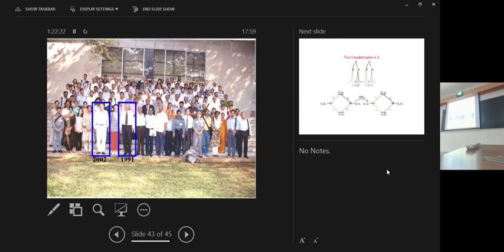In materials chemistry, of course, other things also become important, like spin 1. But a spin 1 nucleus has a quadrupolar moment, which brings more complications. Lines are broader there, because the quadrupolar moment provides a relaxation mechanism. So that's generally critical, and we avoid that in biology. That's why you go to nitrogen-15.